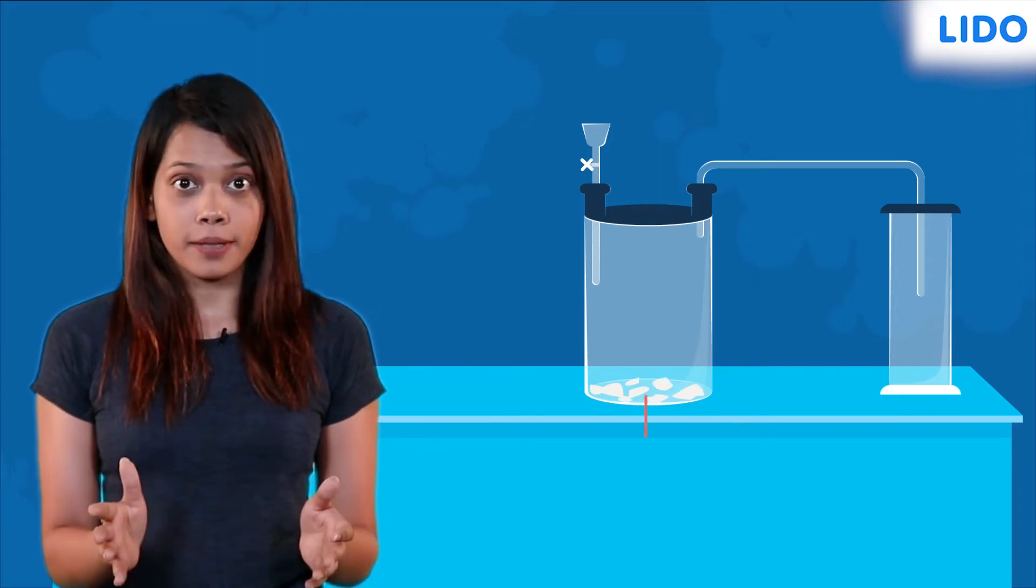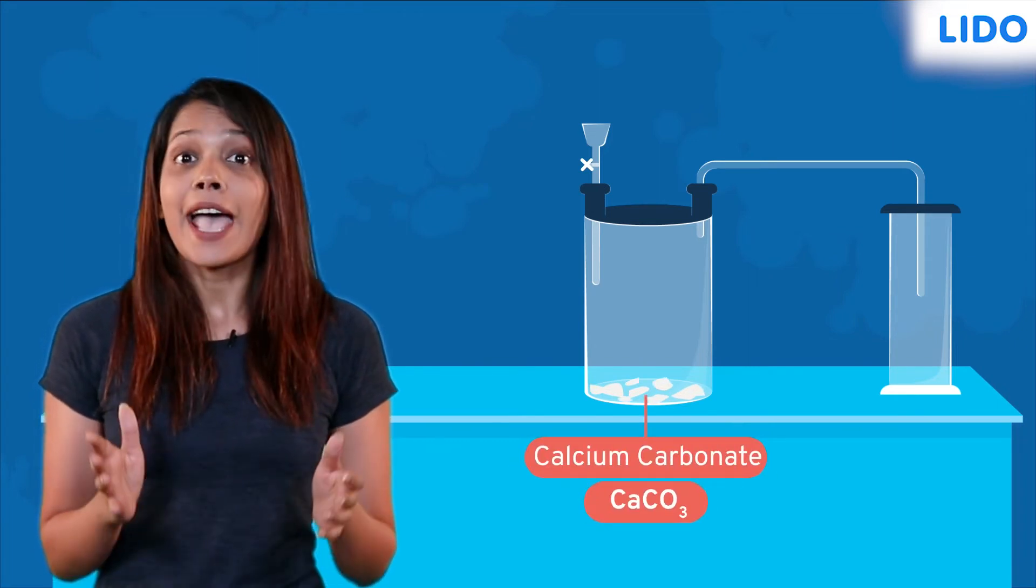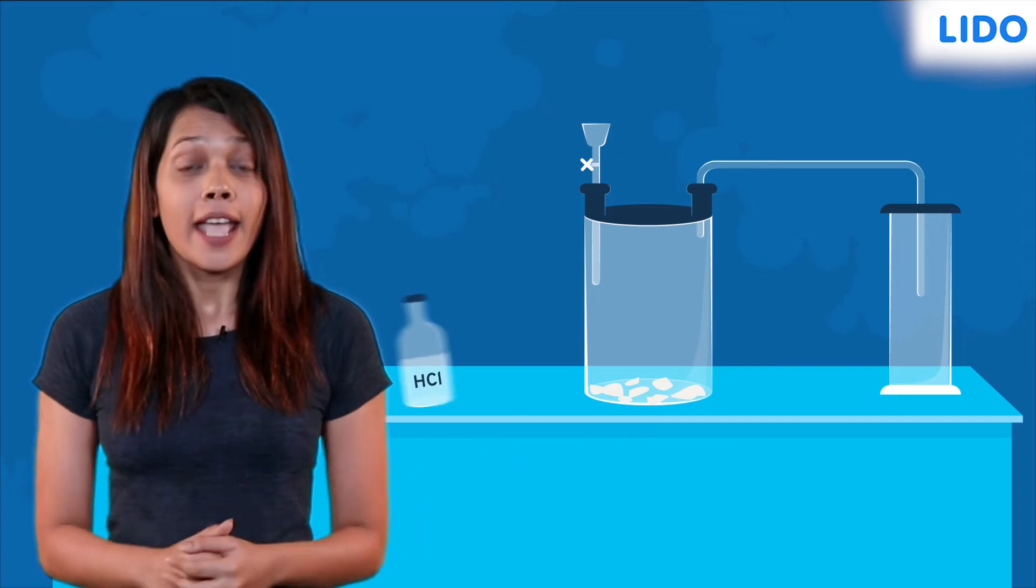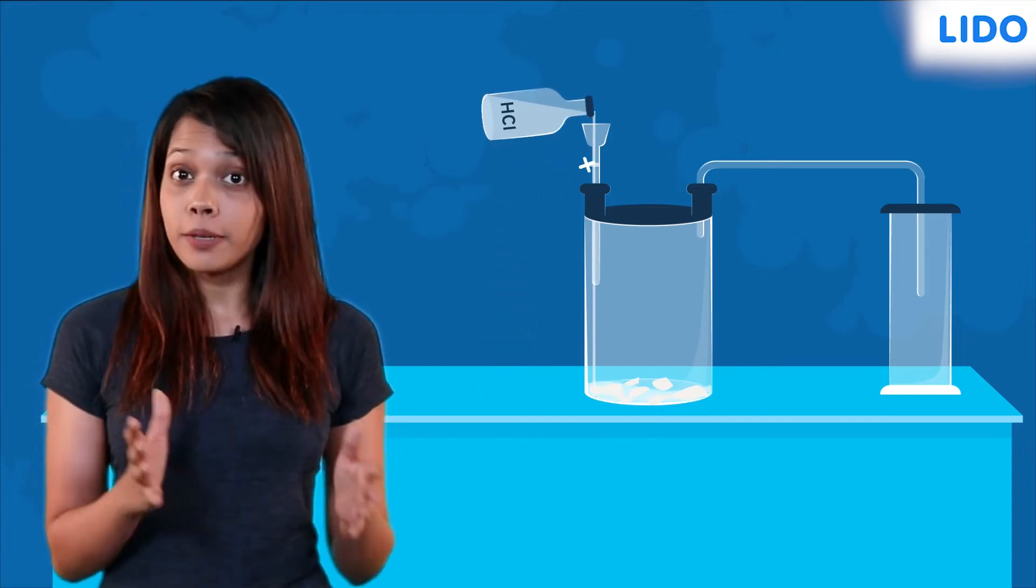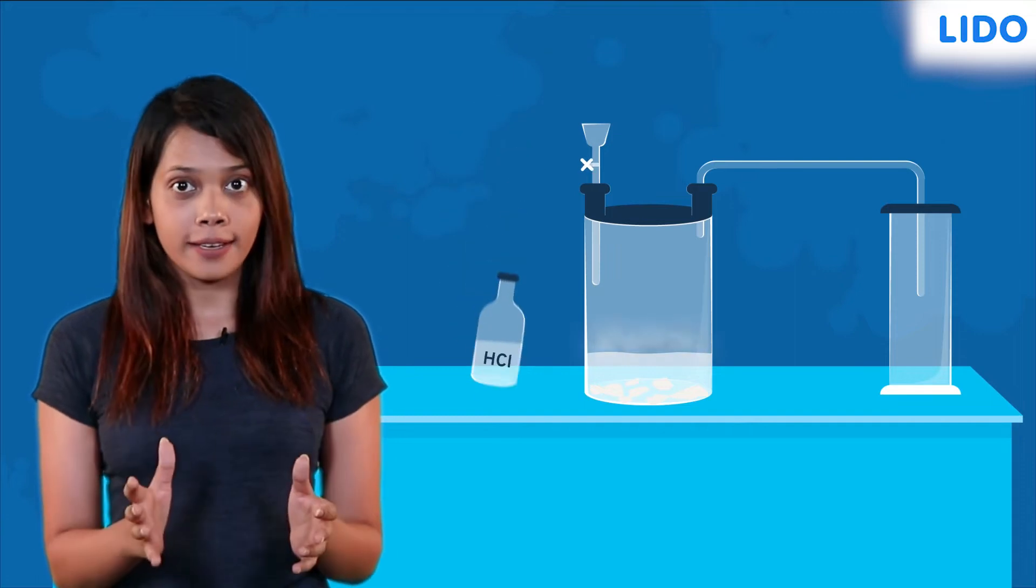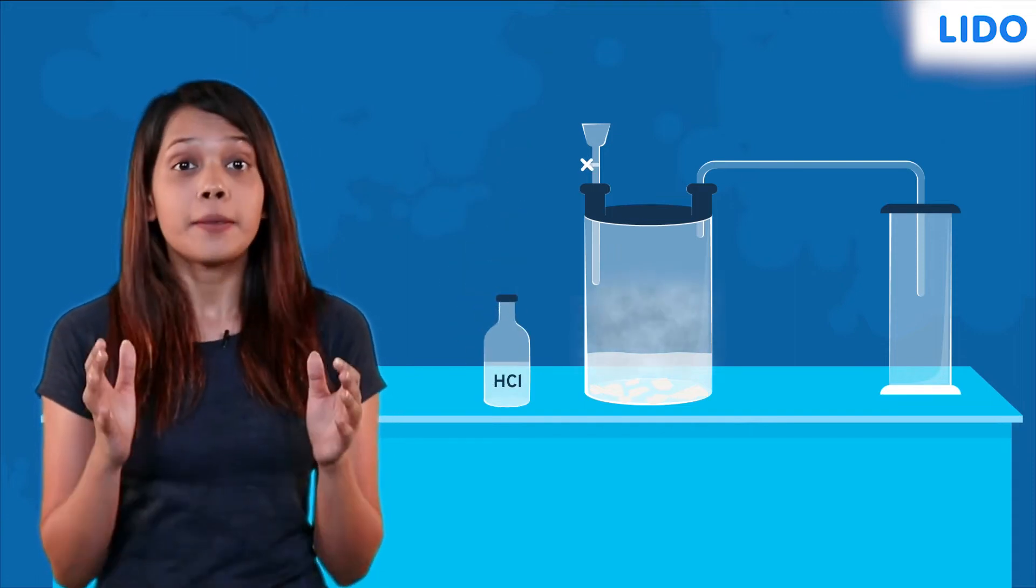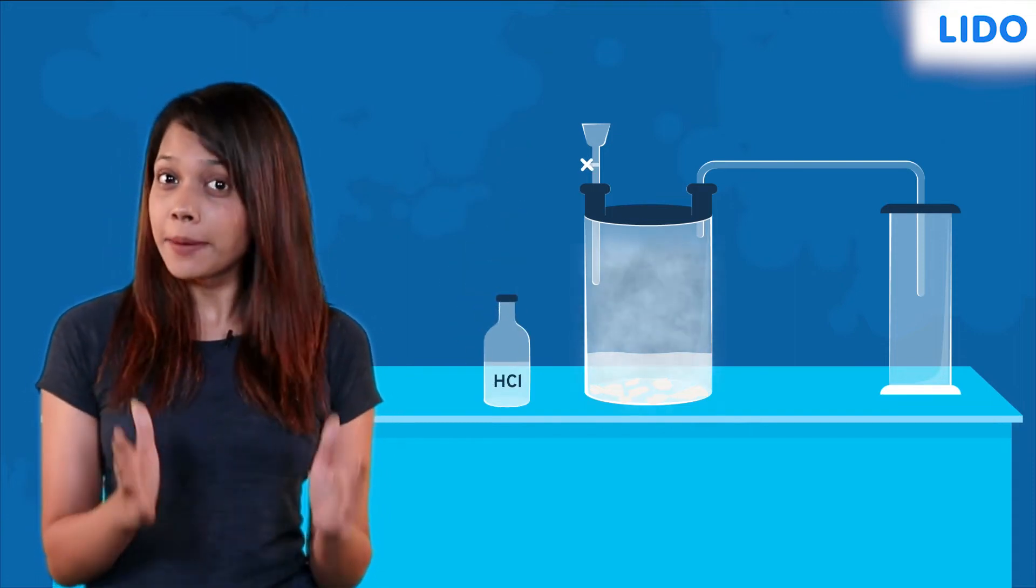To get started, we need pieces of marble or calcium carbonate as the starting material. Now we pour some dilute hydrochloric acid into the marble chips through the thistle funnel in such a way that the marble chips are completely immersed in it.